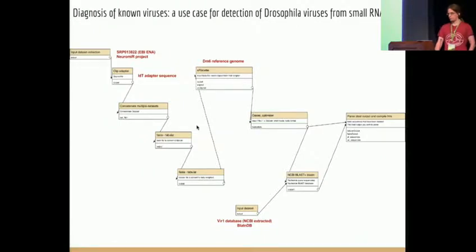One thing that we do is we collapse all the sequences. It may seem counterintuitive, but we find that the discovery and diagnosis works just as well when you collapse all the sequences that are identical, which with small RNAs means an even bigger reduction. And then, as I said, we align it to the host genome or other things that we're not interested in. And then we run Oases Optimizer, which just takes Velvet with different k-mers.